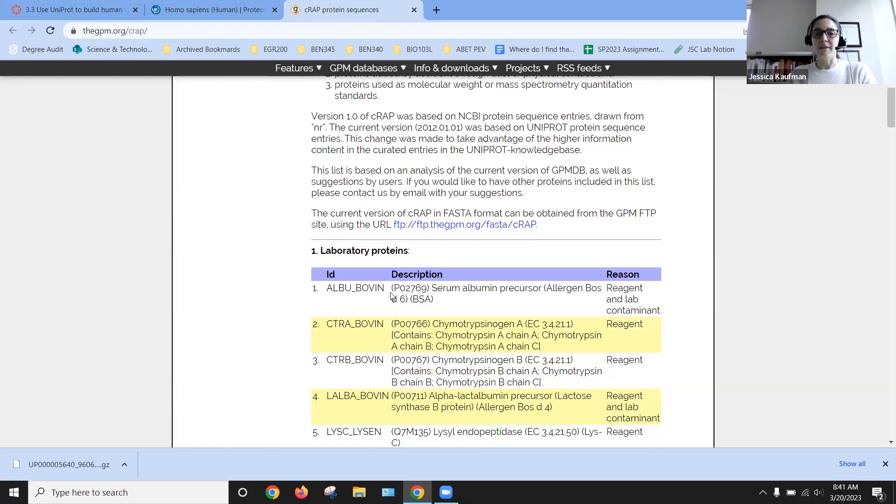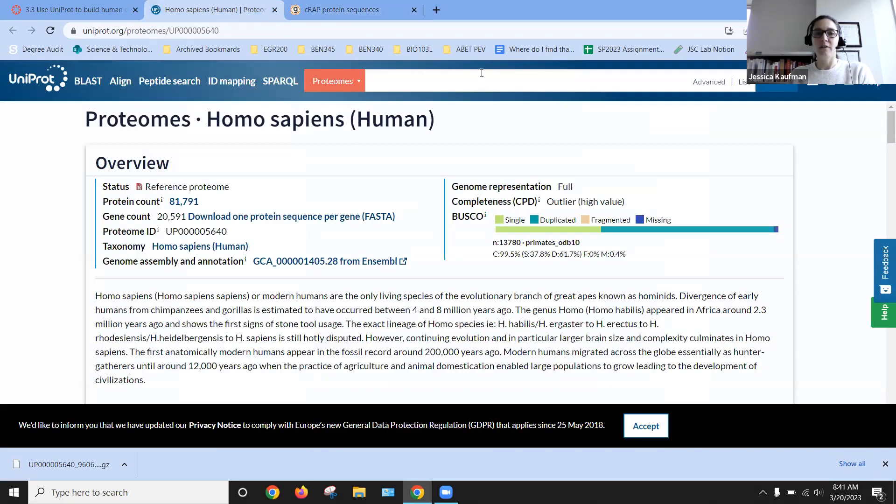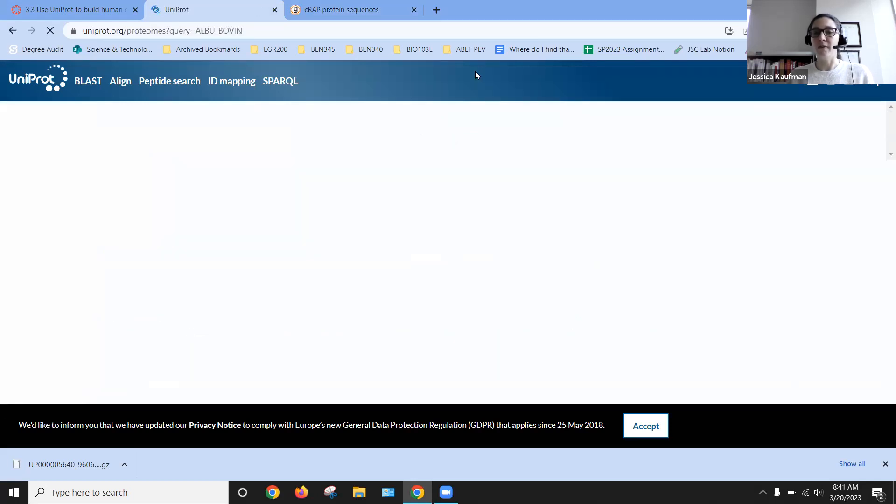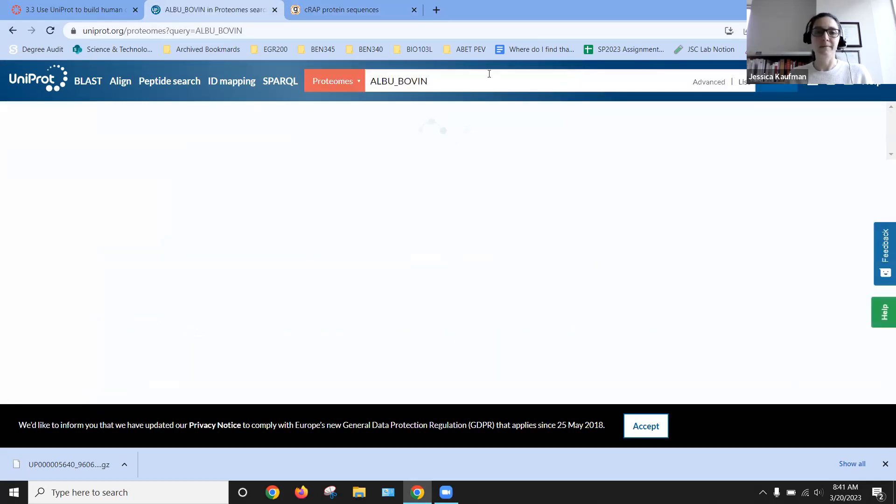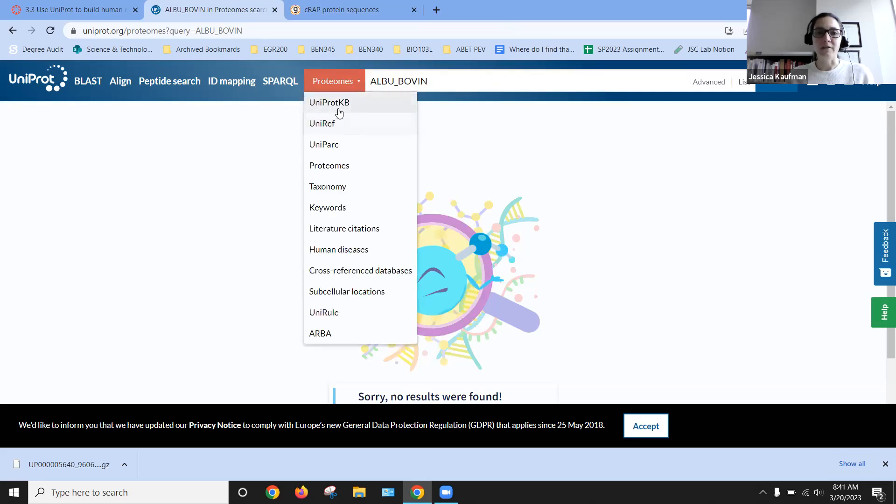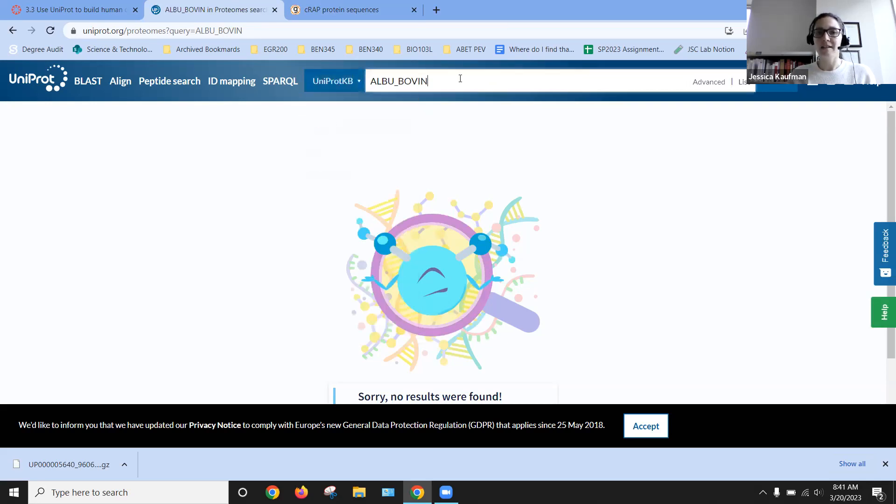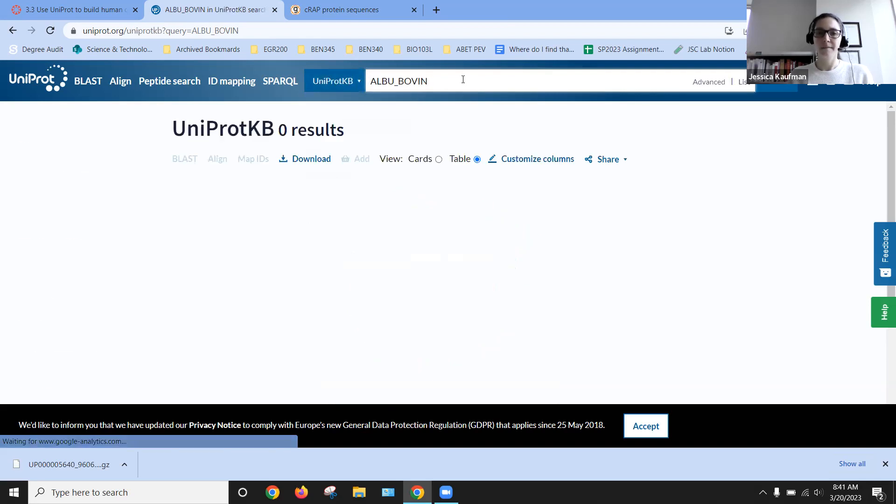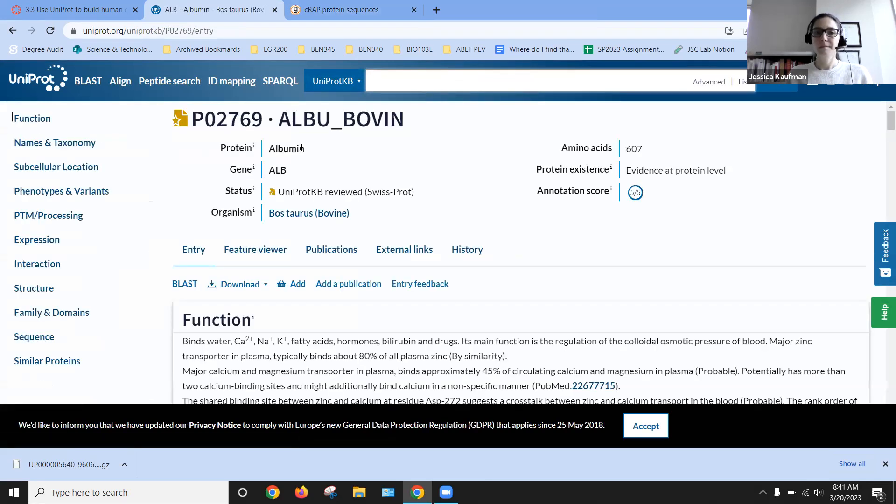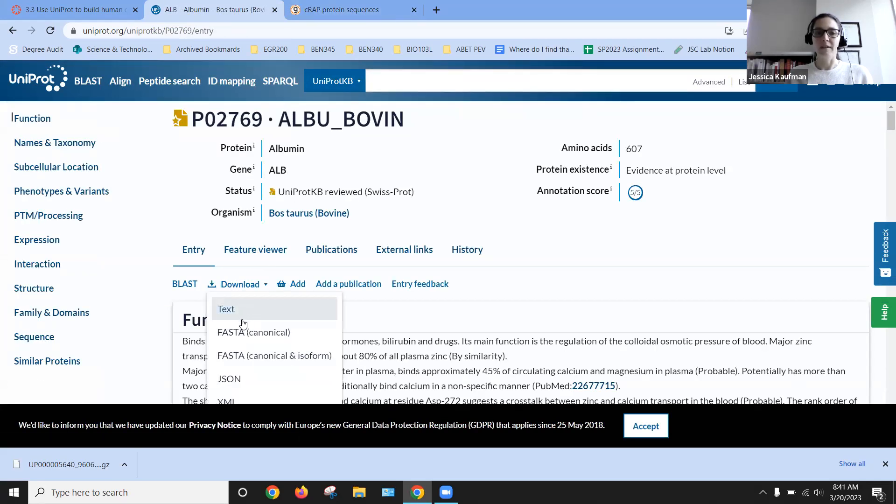So we can look up the names of those proteins on UniProt. I'm going to show you how to do this for bovine albumin. And I was looking in the wrong part of the database.